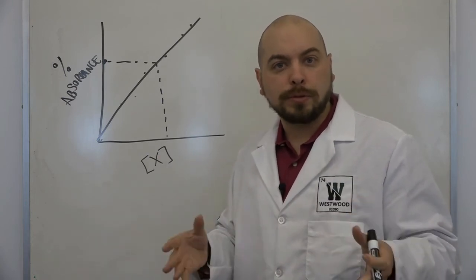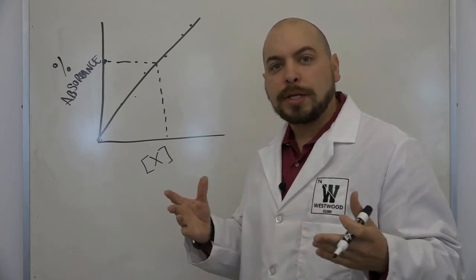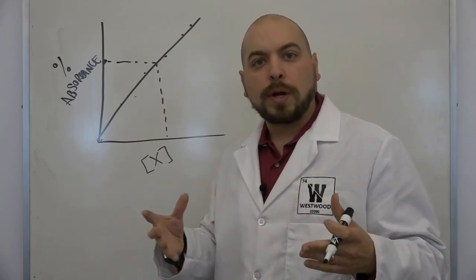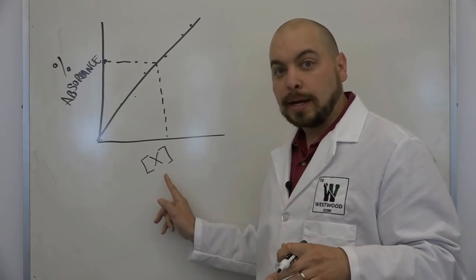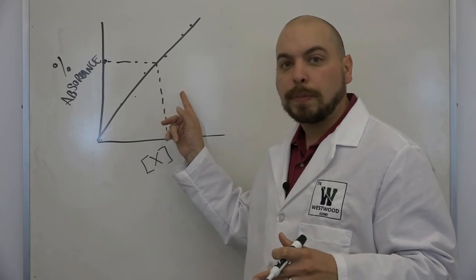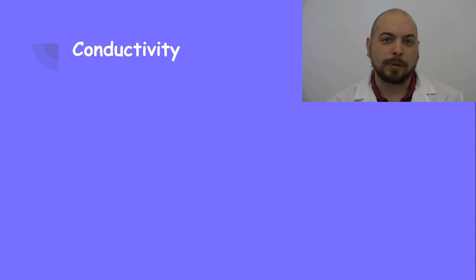So this is our second way of using Beer's law to actually measure experimentally the concentration of an unknown solution. Now, be aware, because Beer's law is a direct relationship, you're always going to be dealing with a straight line. The only question is, at what slope, and what is the relative relationship between the absorbance and that concentration. So what we can do is simply use this line to make a prediction of our concentration given a known absorbance. So now that we've experimentally measured the concentration using light absorbance and transmission, the technique of spectrometry, we're going to do it in the second way.